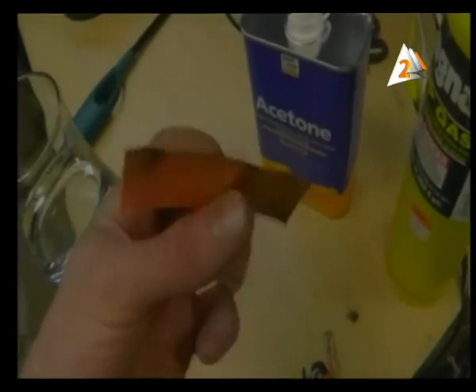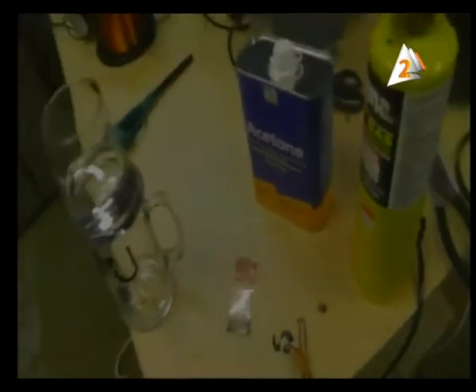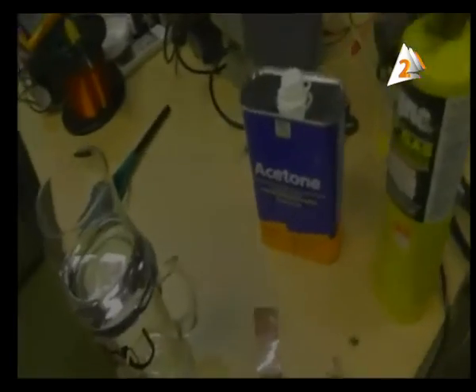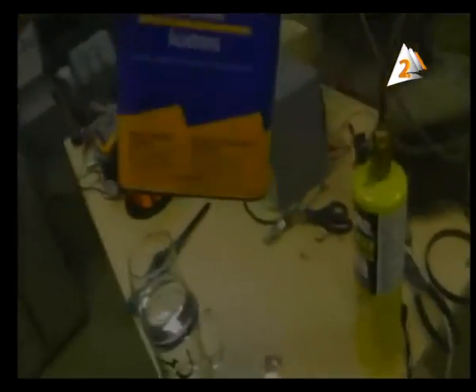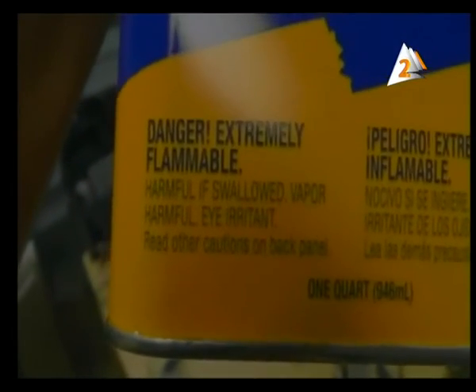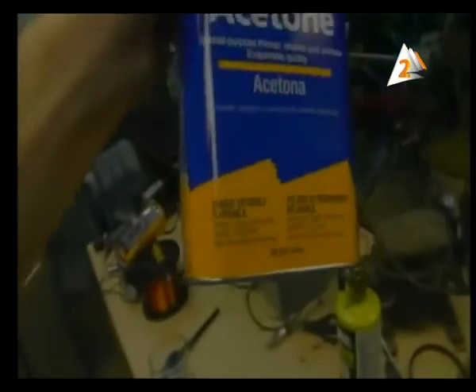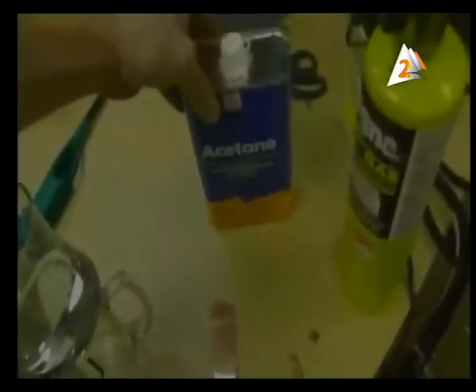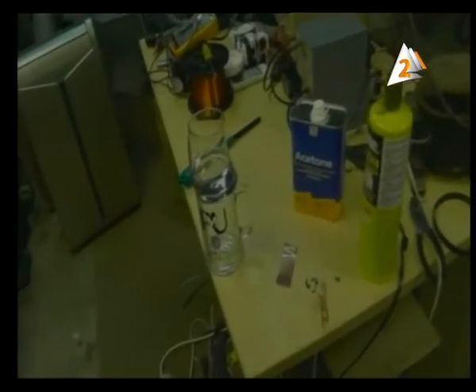Here we have a sheet of copper and we have some kind of liquid, acetone, and we have these two cups or two beakers. So what will happen after that? This acetone is a normal one. It's a dangerous acetone. It's a flammable material and gives high temperature. It's difficult to use.